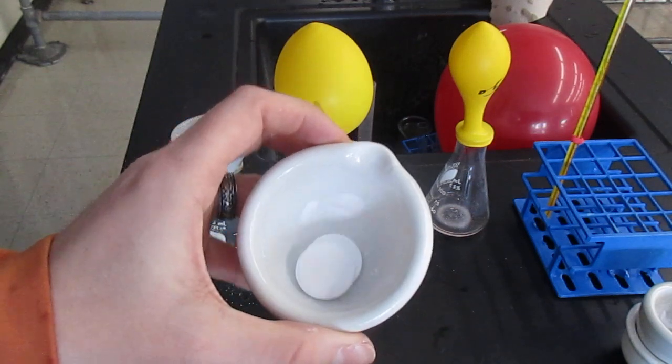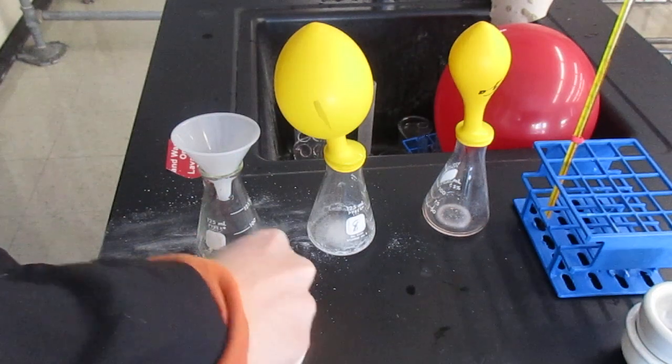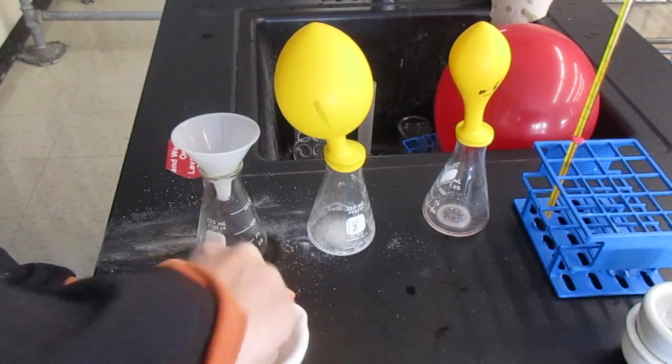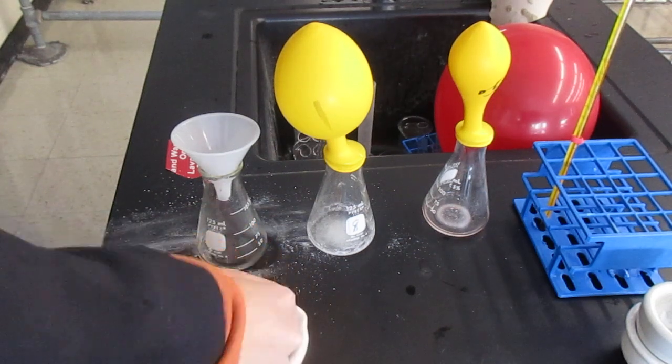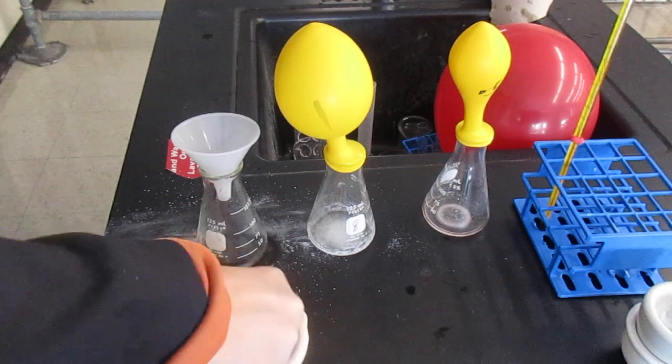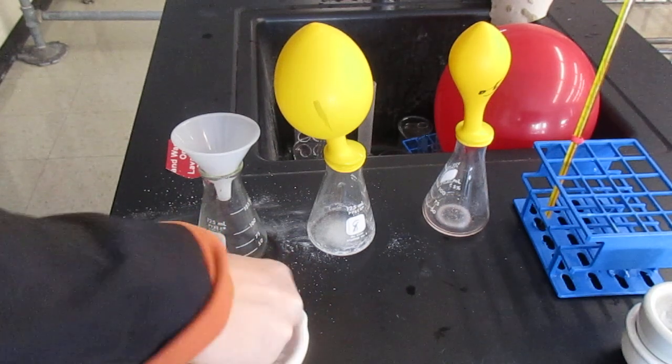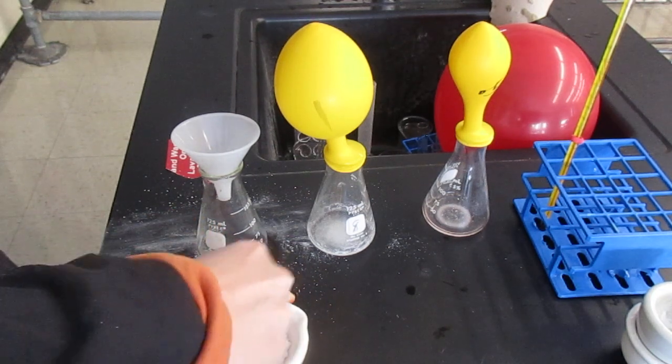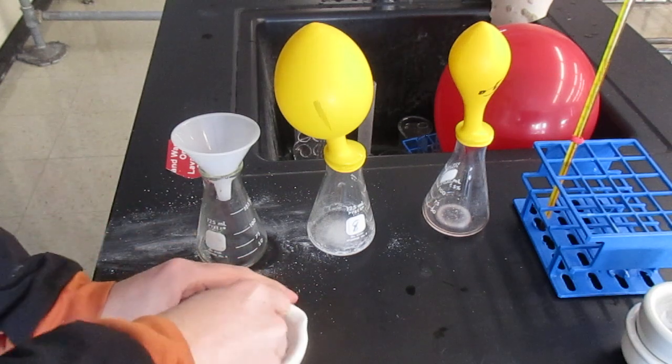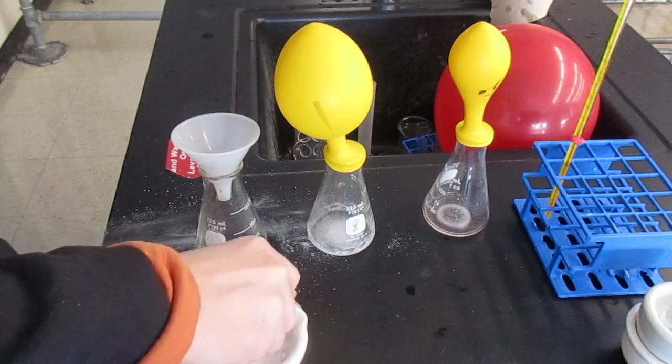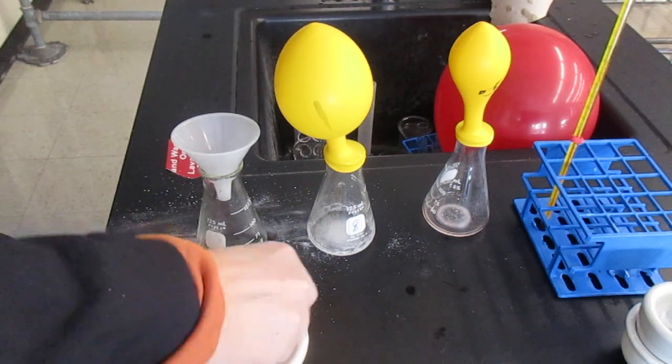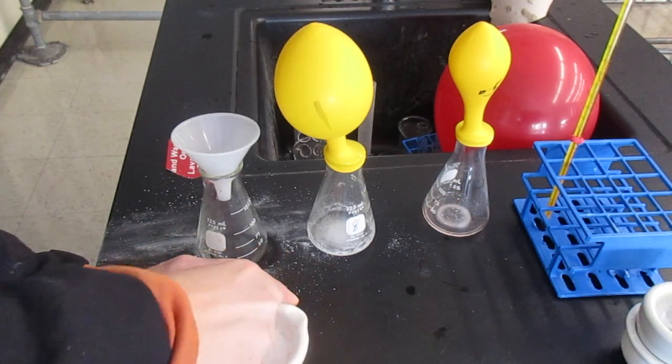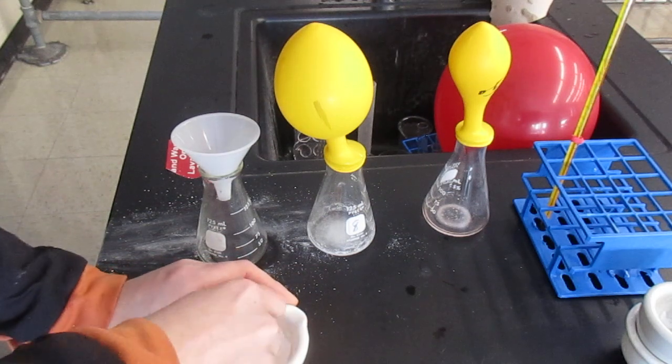So two Alka-Seltzer tablets are in here. Just going to crush this to make sure there's not really that much chunks in there. The nine milliliters of water is already back into the flask, and this time I grabbed a funnel to help me not spill, which I should have done the first time, and to be honest with you, I just wasn't thinking very well.